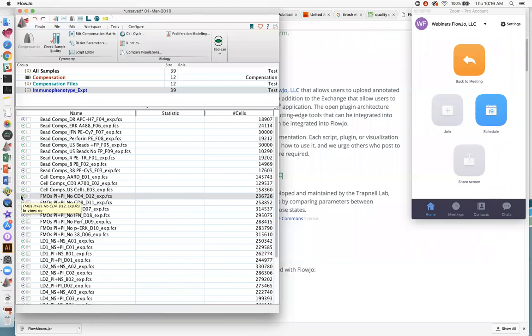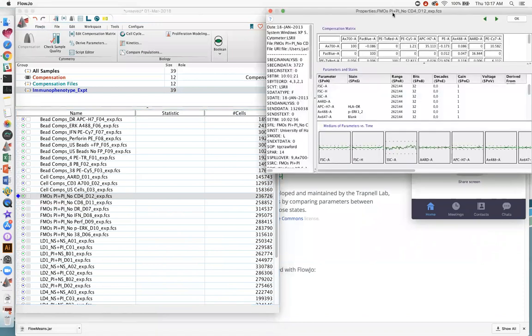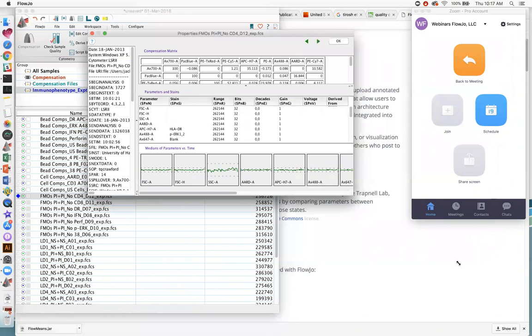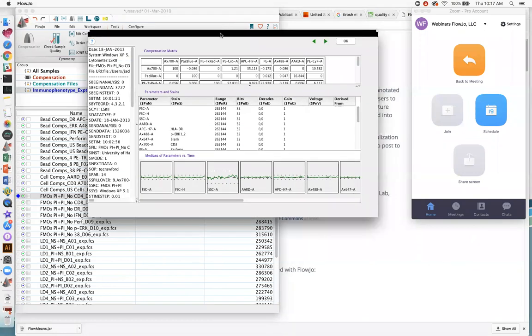And then the other thing that sometimes happens is I've seen people change voltages during acquisition, or perhaps a laser is starting to peter out, and so either the voltage goes up or goes down, and you see this increased power and then weakening trend therein. In that case, that will also trigger the sample quality check to flag the sample.